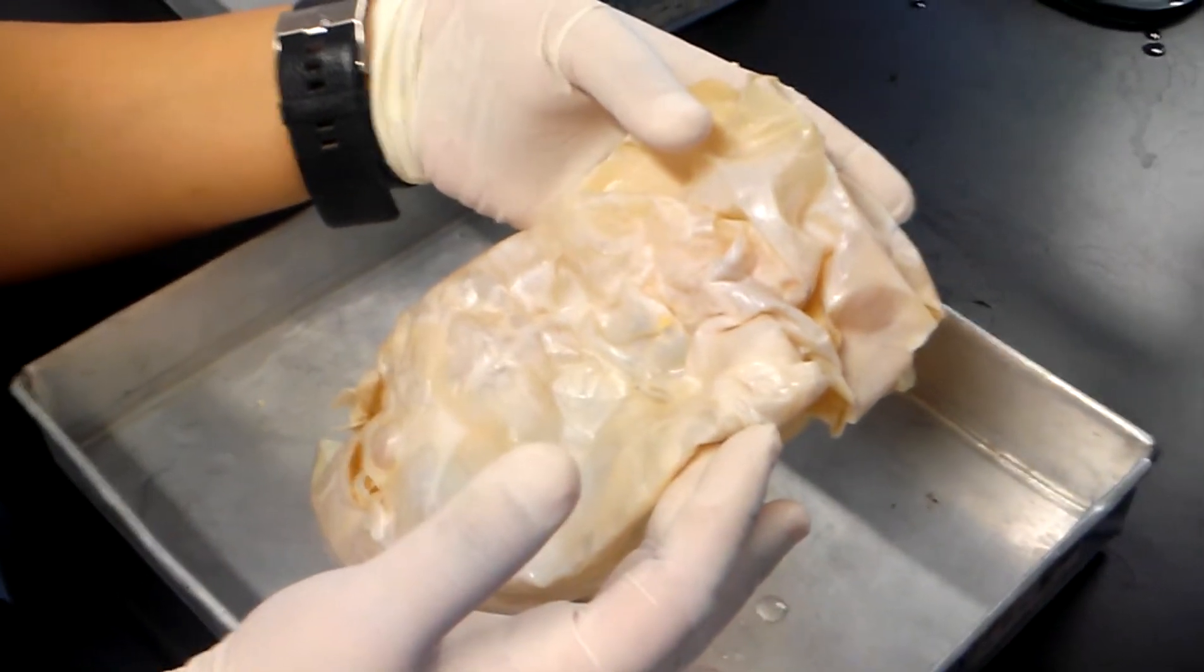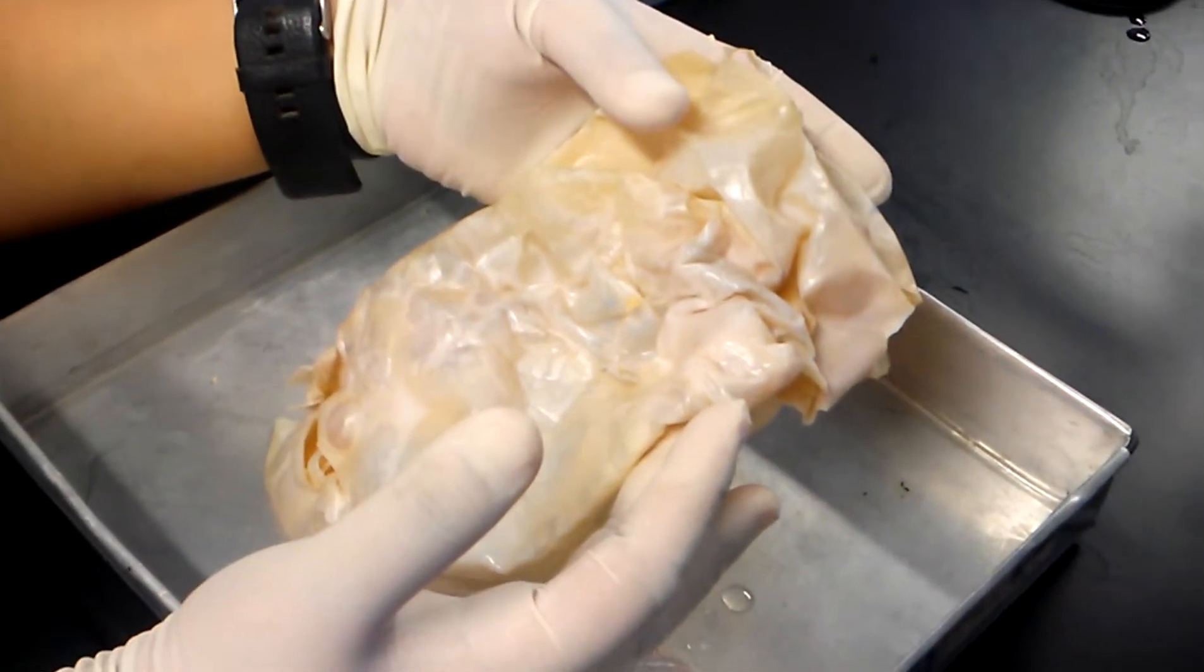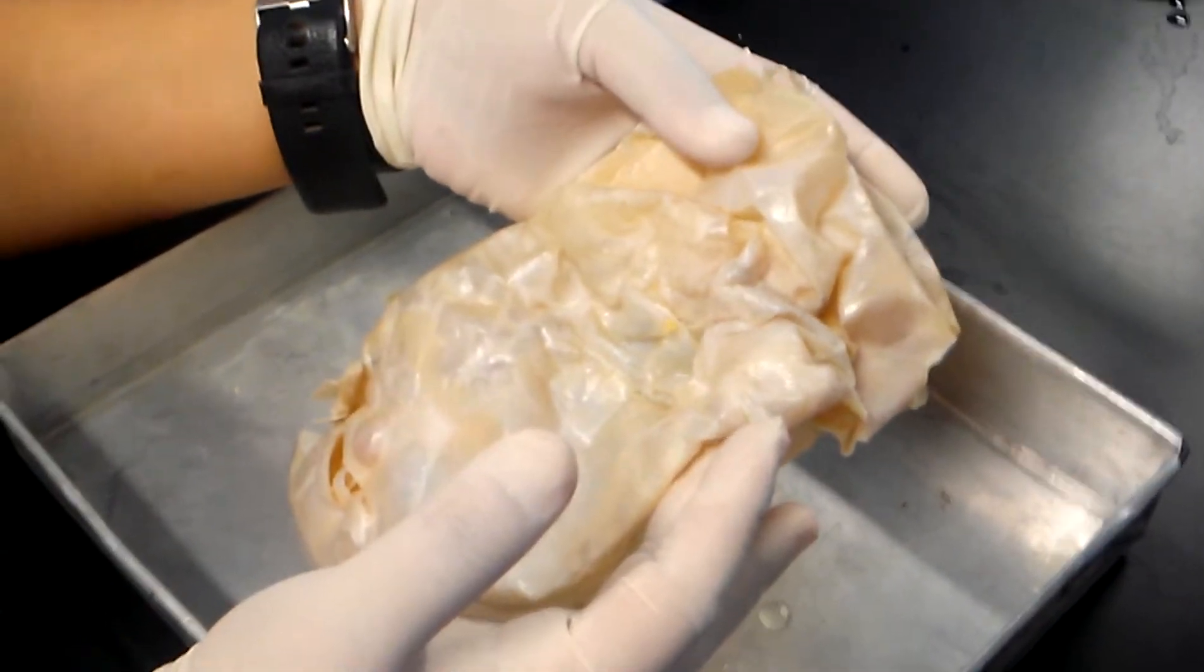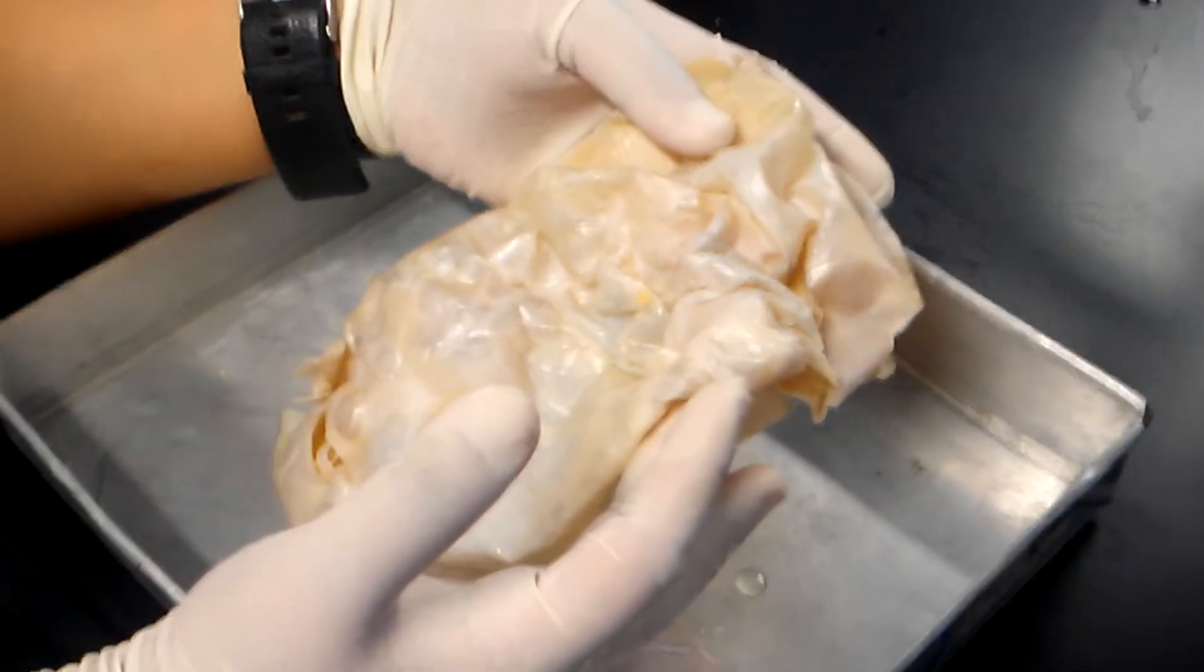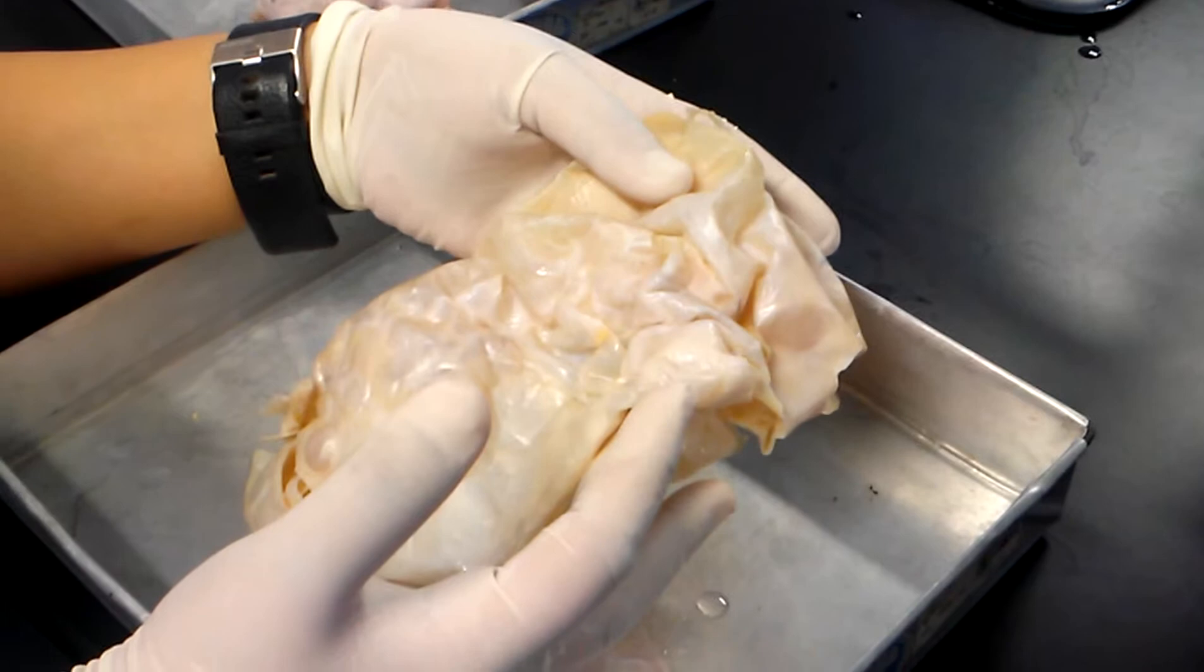And if it is malignant, you call it mucinous cystadenocarcinoma. But you will be able to tell if it's mucinous or serous if you look under the microscope.